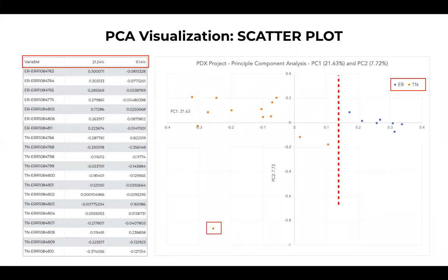So we did quite a few things. We built a pipeline. We got a table of expression, and then we did some normalization, logarithmic and quantile normalization, which is possible through the platform using the utility section. You saw that. Maybe I can give you a demonstration later as well. It's pretty simple to reach up to here. And we also did PCA using that data, and after doing PCA, we can see that these are separated into two classes. So this is what we did so far.